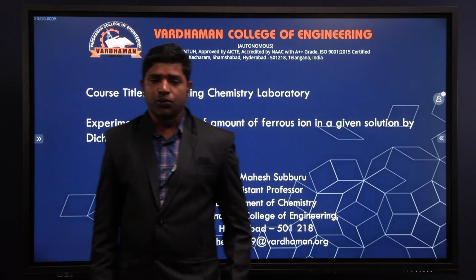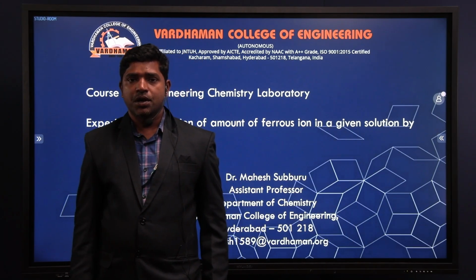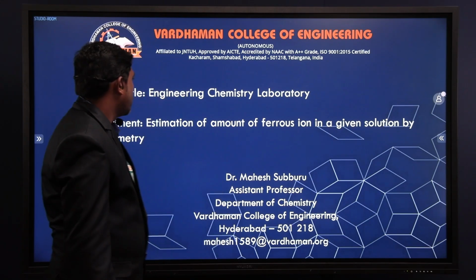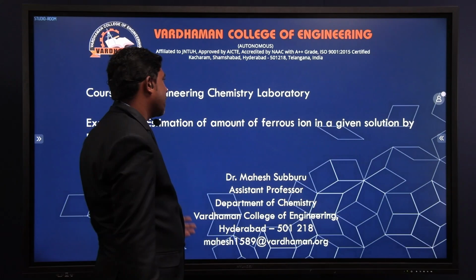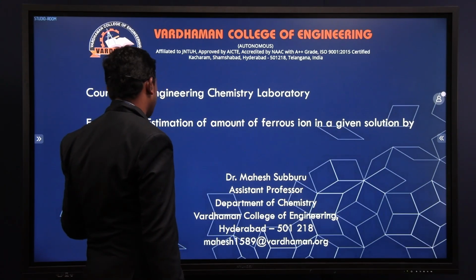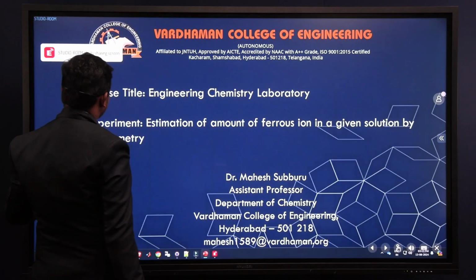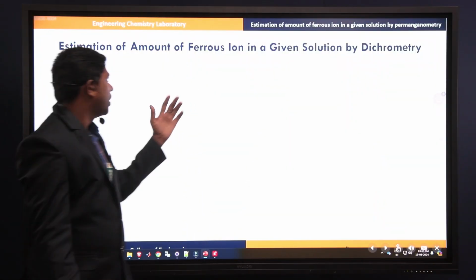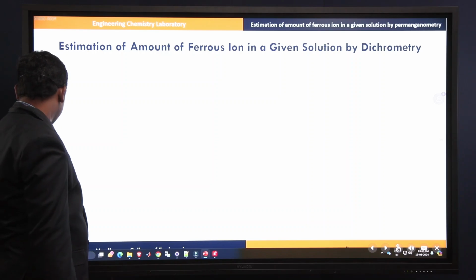Good morning, welcome to all. Myself, Dr. Mahesh, Assistant Professor, Department of Chemistry, Vardhaman College of Engineering. Today I would like to explain the estimation of the amount of ferrous ion in a given sample solution by dichrometry.